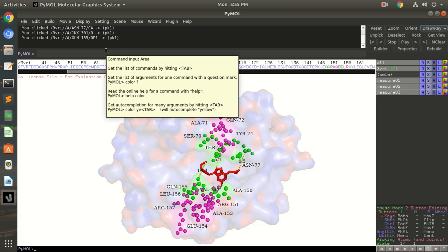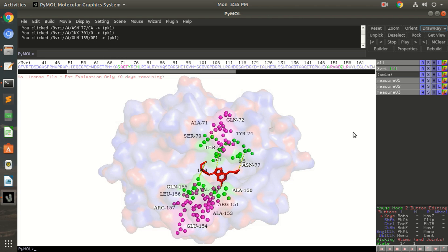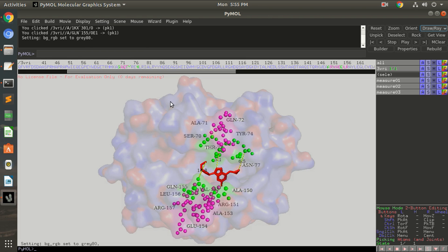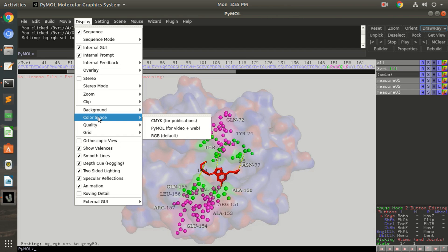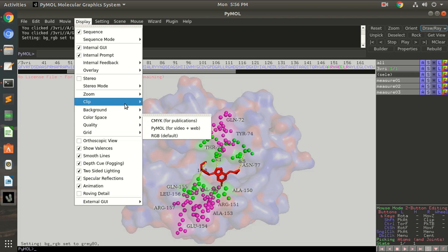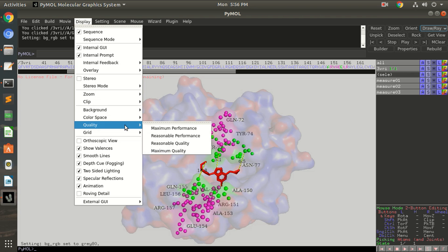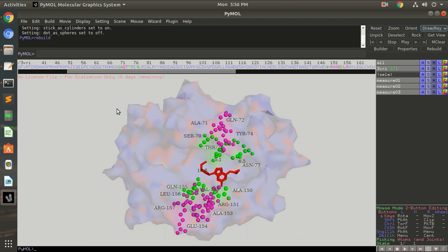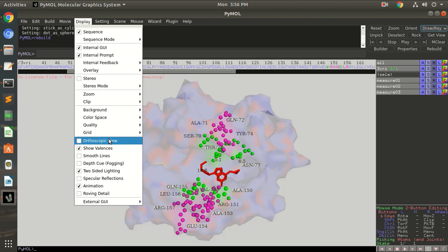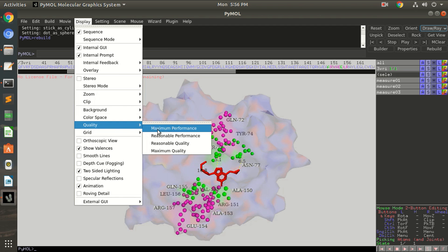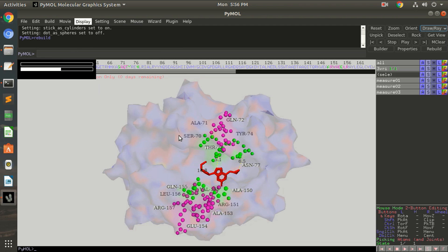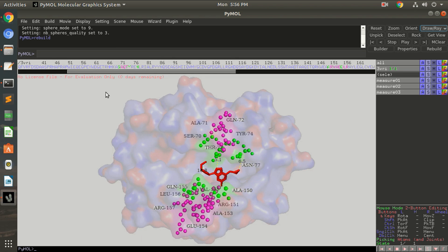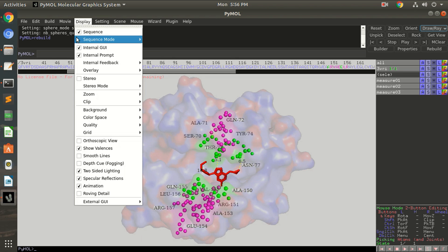So that much you can do with your protein complex. But there is always more. You can change the display settings. You can set the background to light gray or whatever you want. If you want to set it for publications or video web, I always keep it defaulted RGB. You can change the quality to get maximum performance, but I think it's better to keep it at a reasonable performance.